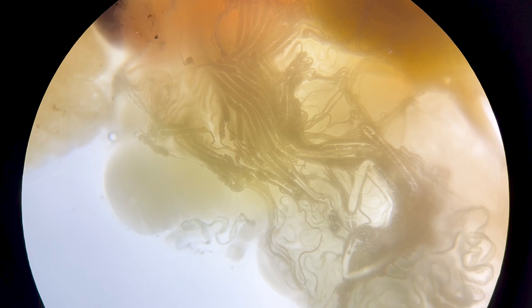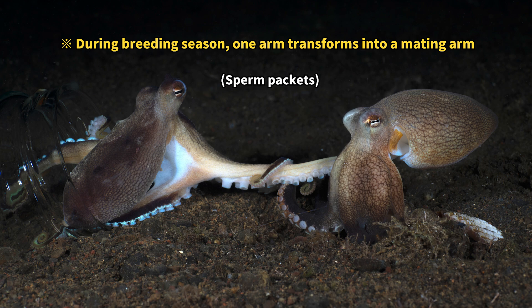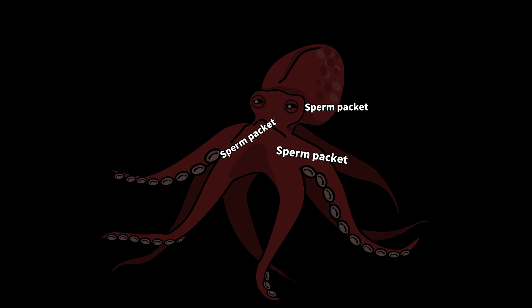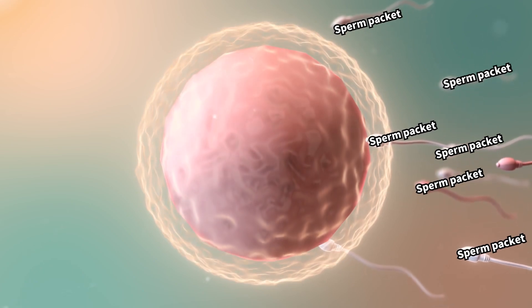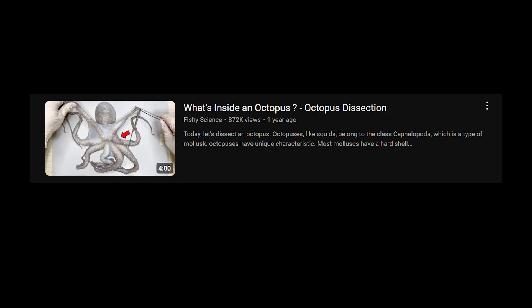When you zoom in on the male reproductive gland of a fresh octopus, you'll see the sperm packets tangled together — you can even see them moving. The male places these sperm packets inside the female's body to mate, but fertilization doesn't happen inside the body. Instead, the female stores the packets, and when she lays the eggs, the sperm packets mix in with the eggs and external fertilization takes place.